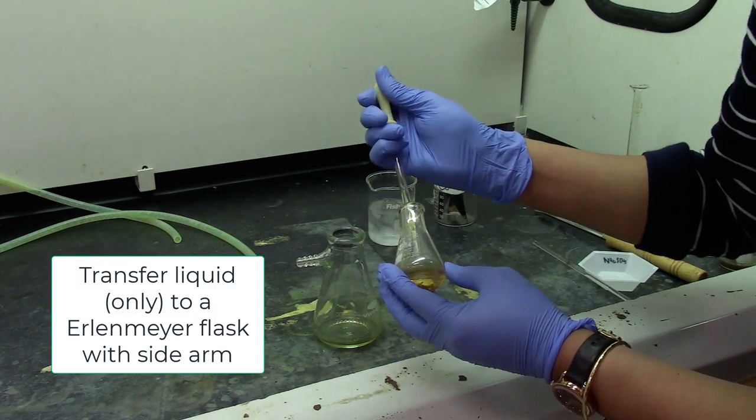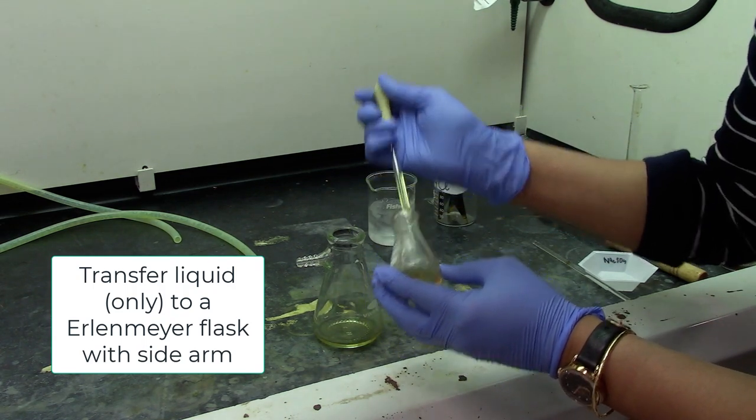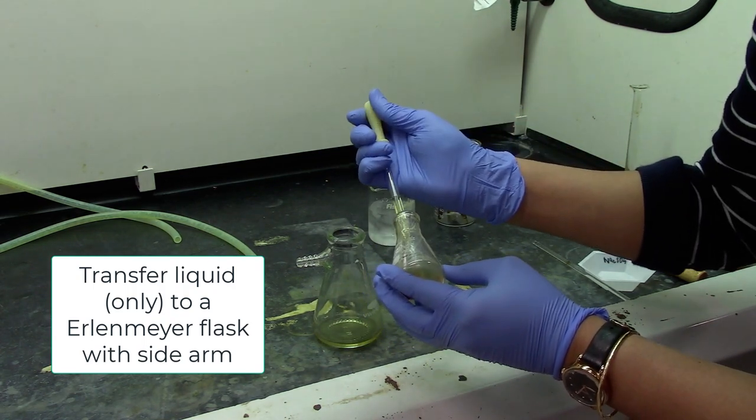Now use a clean dry pipette to transfer just the DCM layer, not the sodium sulfate, into an Erlenmeyer flask with a side arm.